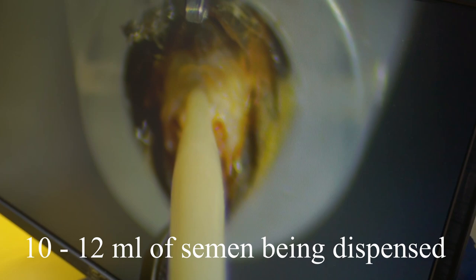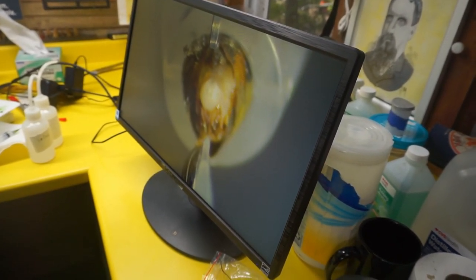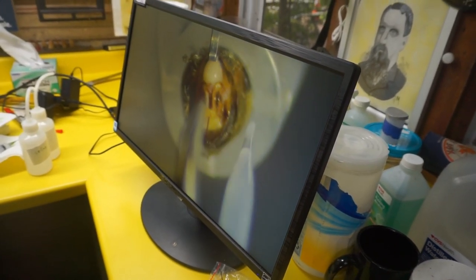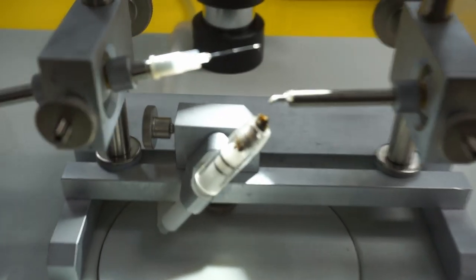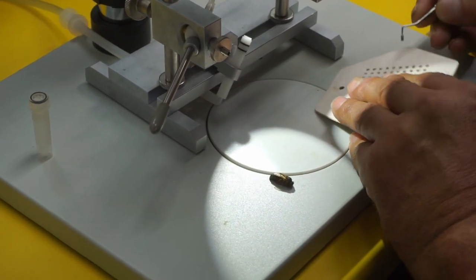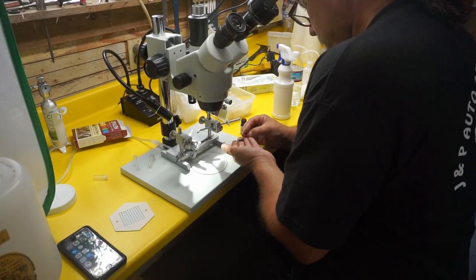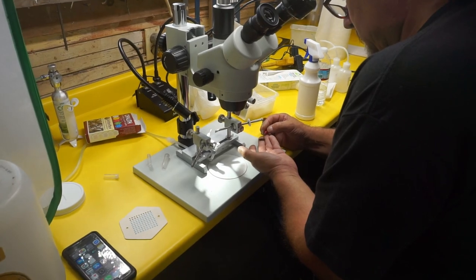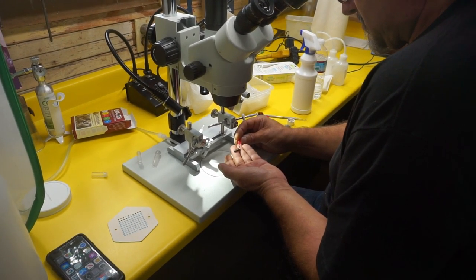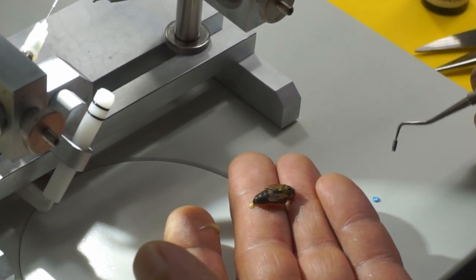How many is it? It's like between 10 to 12. Okay, so this is going to be number 14. Write that down. Never seen a queen so still when that's alive. She just pooped or something, okay.